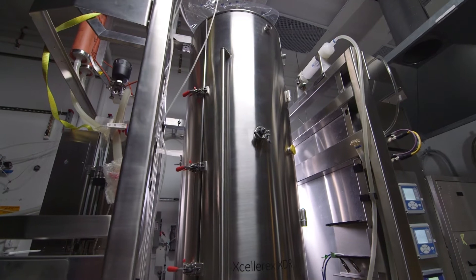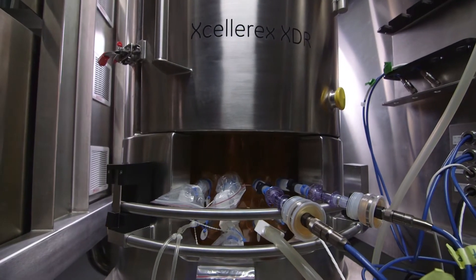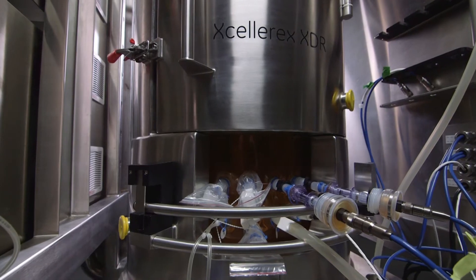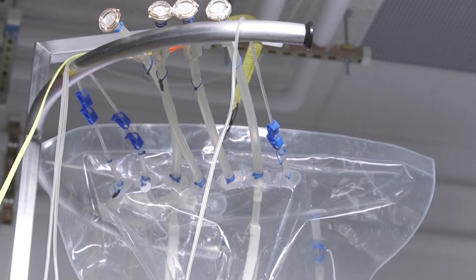This is the XDR500 MO Fermentor from Cytiva, designed to bring all the benefits of single-use technology to the microbial fermentation process. The system is designed to address the specific demands of fermentation, such as mass transfer, power input, and metabolic heat removal.